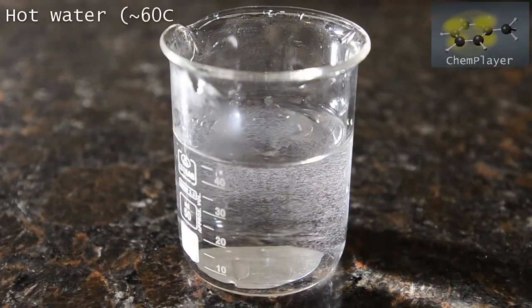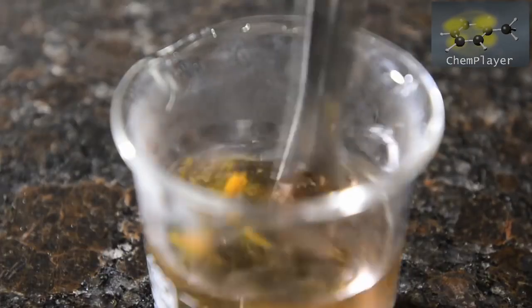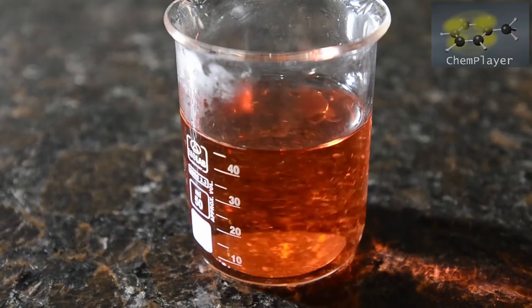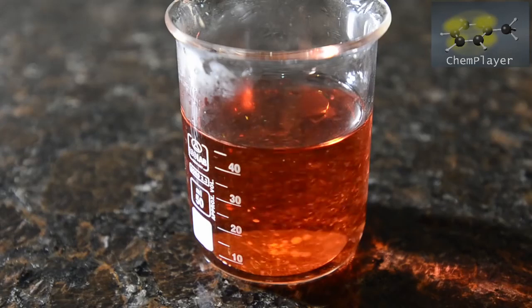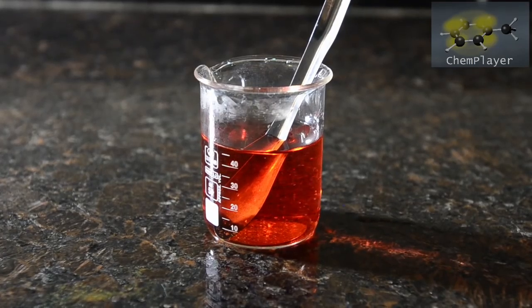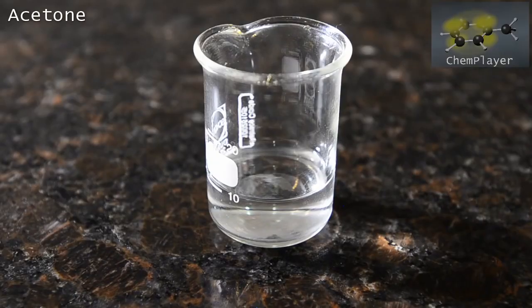Now here's some hot water at about 60 degrees C. And some more product. This time we've got the red color. The yellow crystals seem to be slowly dissolving and creating very intense red color in solution. We're going to take a guess here and suggest that the red color is actually a decomposition product, and that water is reacting. One final test.